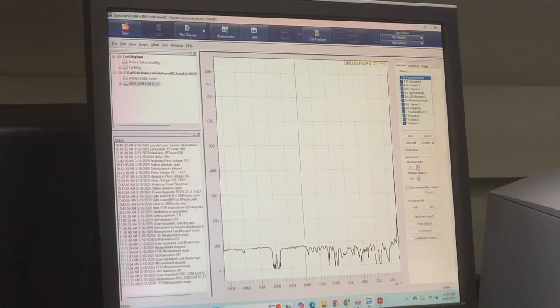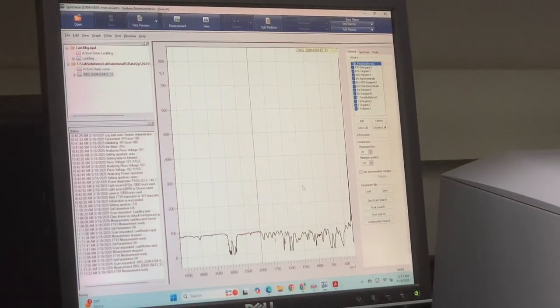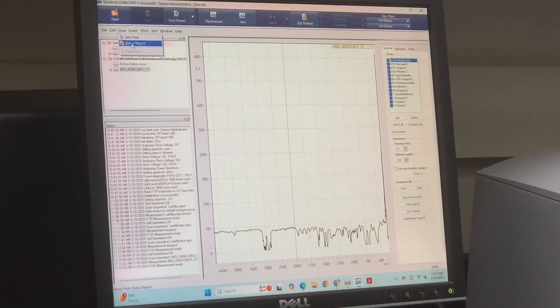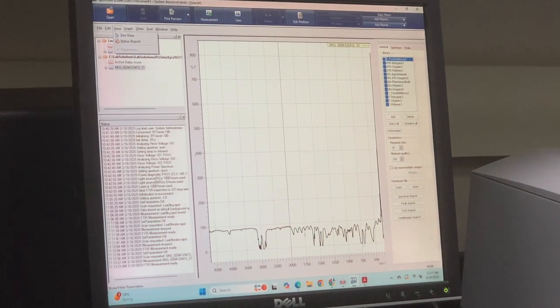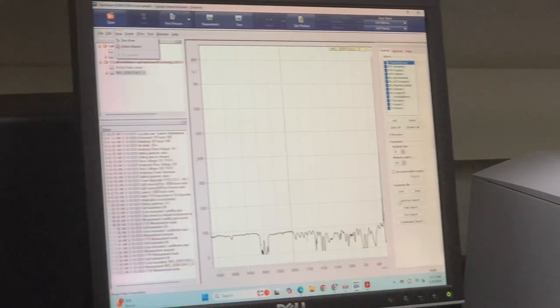Here you can adjust what you're going to see as your output. If we go to the view window, it should show now. Something's not showing right now. Or sorry, I just need to do spectrum search. I need to actually perform the search.